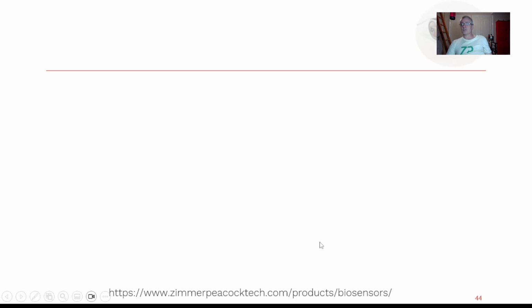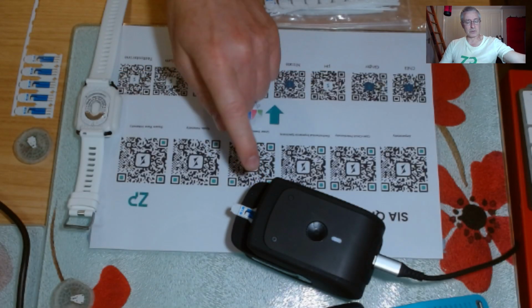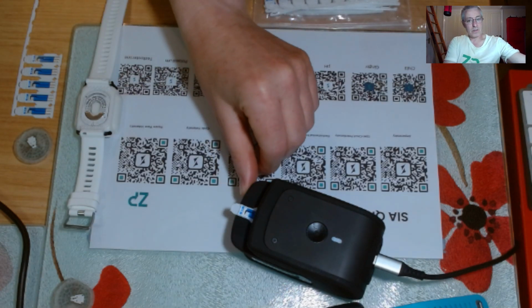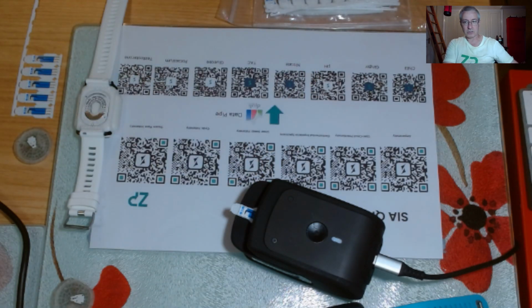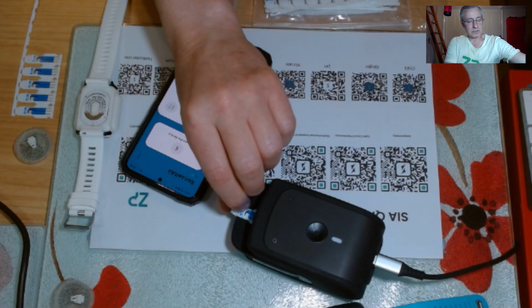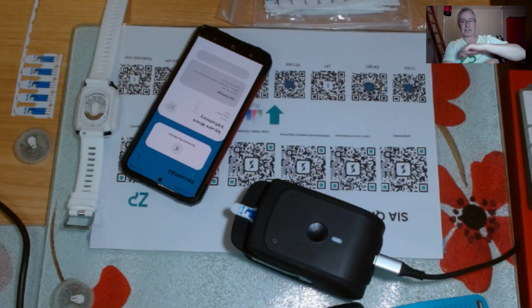So the quick answer is, if you were trying to do it on our Sense It All platform, so this is Sense It All. Let's say I was following a fermentation. I should have grabbed some pipettes. I would find that much easier conversation to have with you, because we could take a drop, put it on there, measure the alcohol using the app, get a result, and we're done. And then the sensor's disposed of. That's an easier application. The challenge of doing that 96 times in parallel is much tougher.